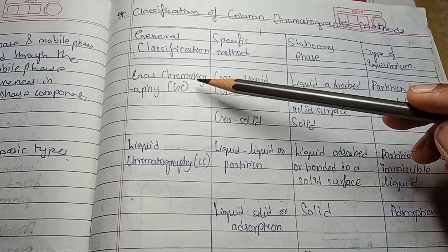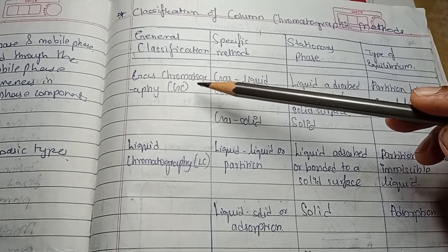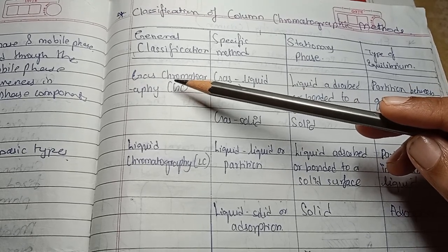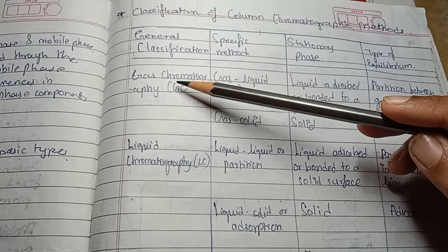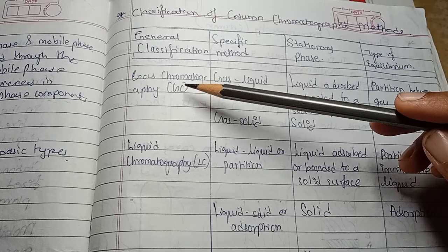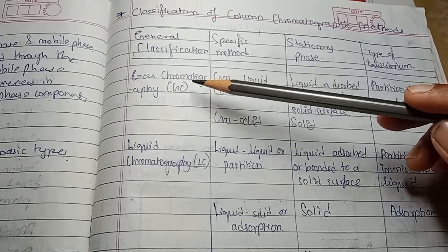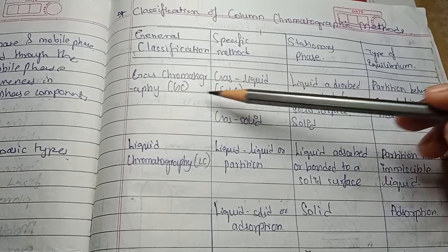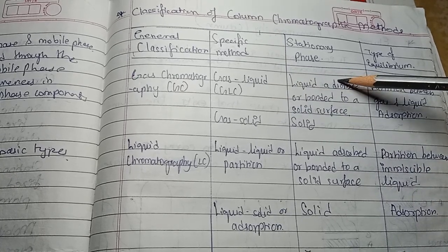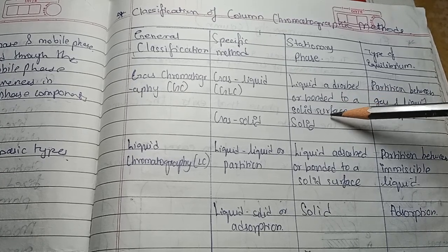Even though their aim is to separate the mixture of components, the function will be different. A number of different elements make these chromatographic methods functional or operational, and they are used with different applications. So in gas chromatography, the method used is gas liquid, which is GLC. The stationary phase for GLC is liquid, adsorbed or bonded to a solid surface.